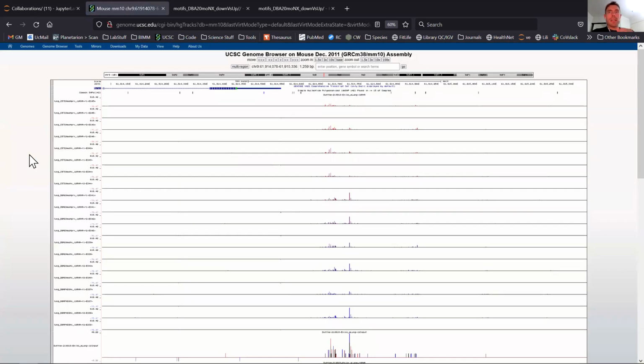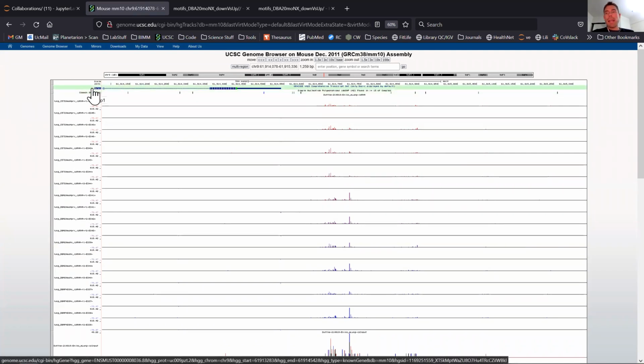And so this is a typical example of csRNA-seq. This is ribosomal protein 1. I like it because it's extremely strongly expressed in RNA-seq. But when you look at it, you actually see all these start sites here. But if you look at it twice, you might realize, oh, actually, these ones are on the upper strand, the Watson strand. So these start sites go this direction, and the gene is here.